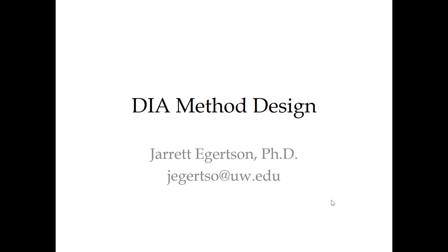Okay, thanks, Mike. So I'm going to try to spend about 45 minutes talking about the fundamentals of method design. As Mike said, I'm going to take you through all of the nitty-gritty steps and the reasoning and try to point out some of the caveats in DIA and these methods that we've developed. The method I'm going to show you is applicable to a Q-Exactive series instrument. That's what we have in the lab. There's plenty of people here who can speak on how to do this for a Q-TOF as well, and I can also try to help you guys. Please interrupt with questions. This is designed to be a heavily interactive talk.